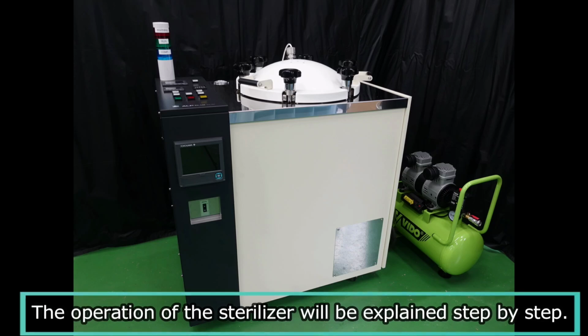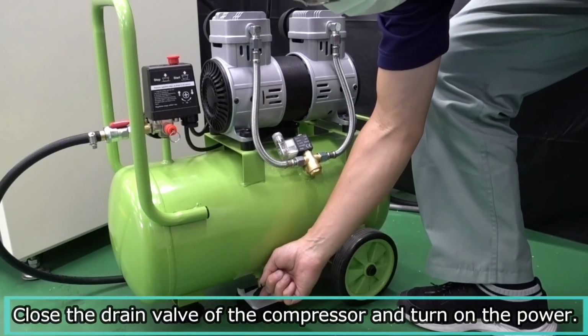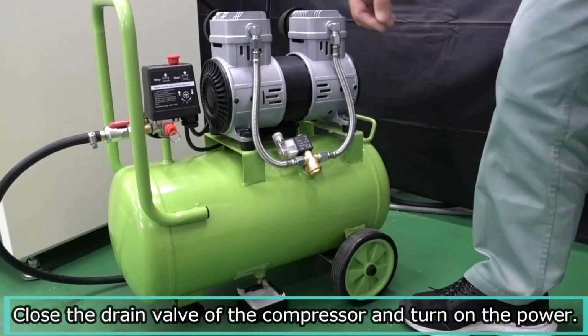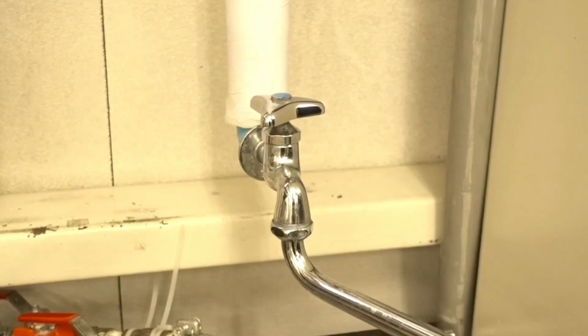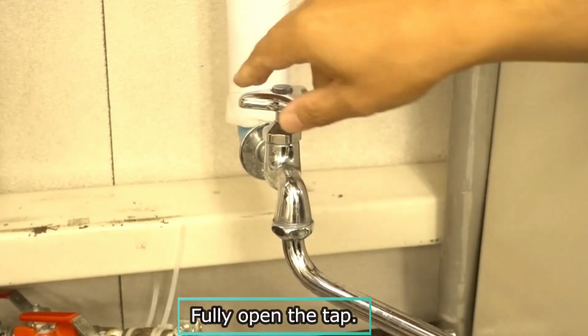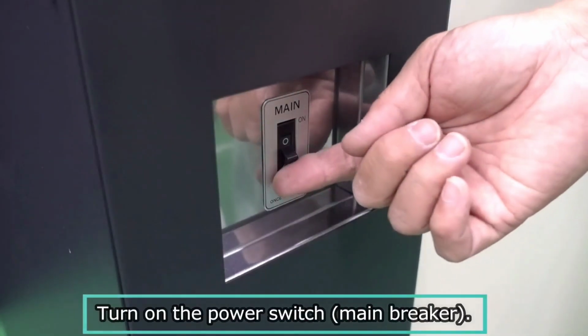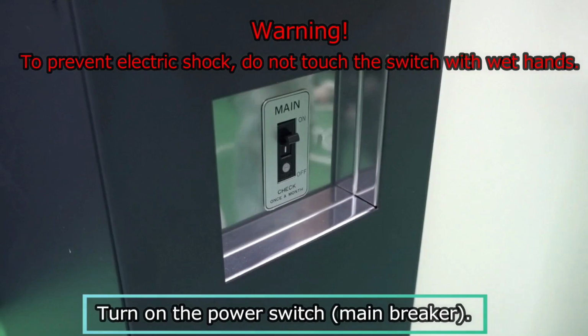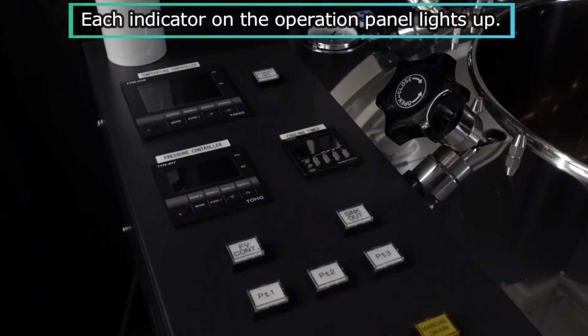The operation of the sterilizer will be explained step by step. Close the drain valve of the compressor and turn on the power. Fully open the tap. Turn on the power switch main breaker. Each indicator on the operation panel lights up.